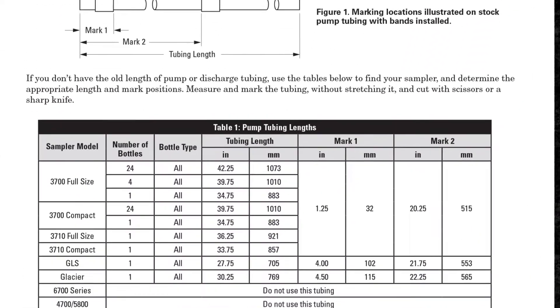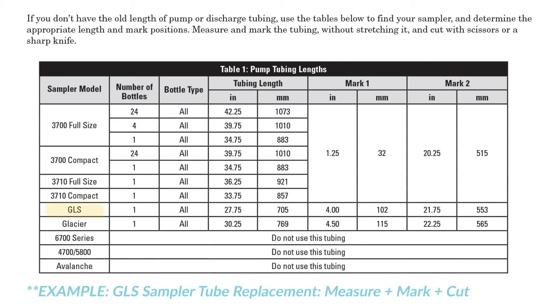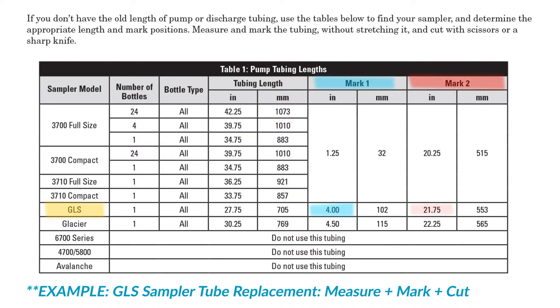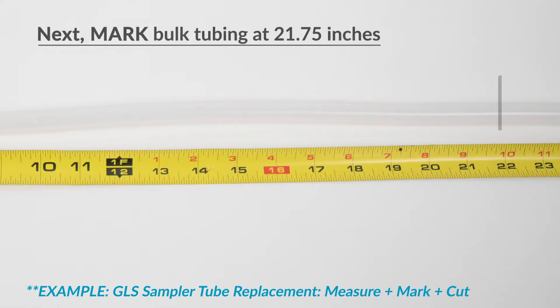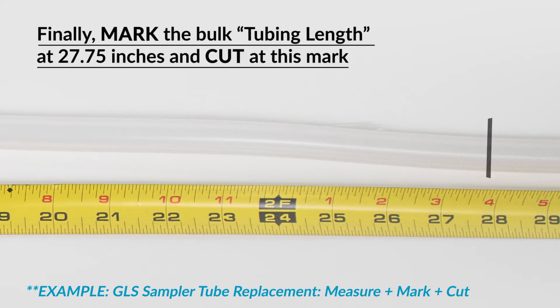Follow the instructions for your specific sampler model and bottle configuration to determine where to mark the replacement tube. Starting at one end, apply the first installation mark. Then measure to the second installation mark. And finally, measure and mark the overall length of the replacement tube. After the installation and overall length marks are in place, cut the tubing at the overall length mark.